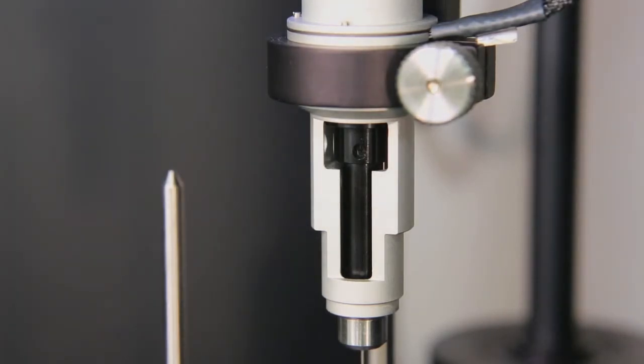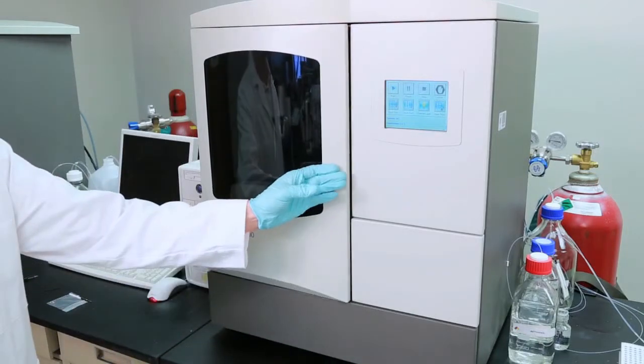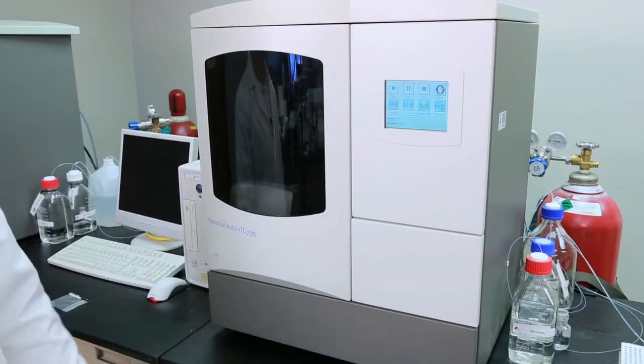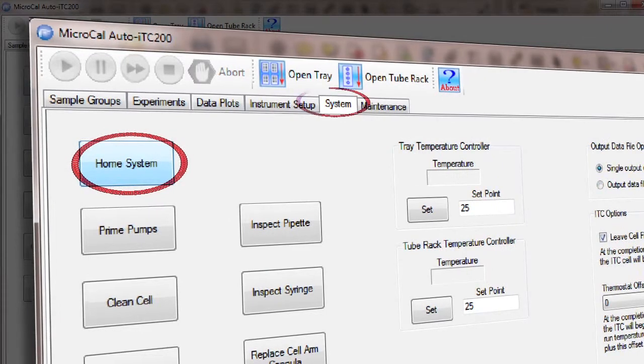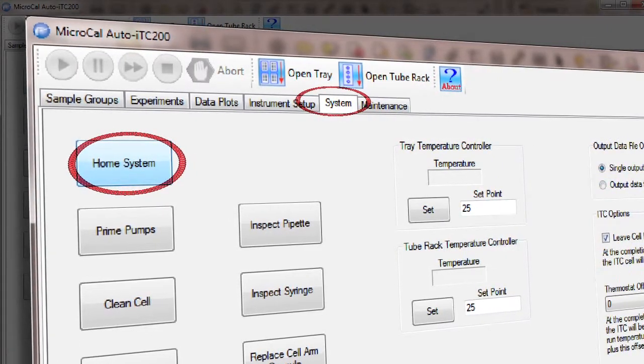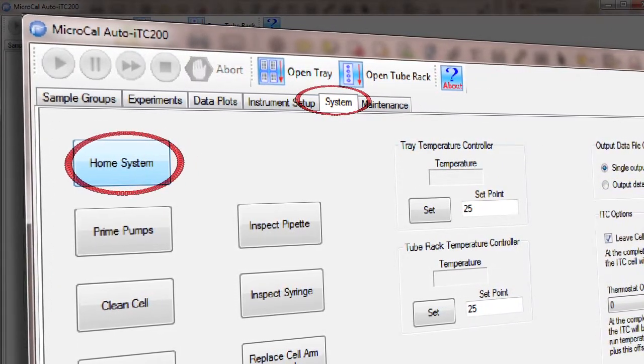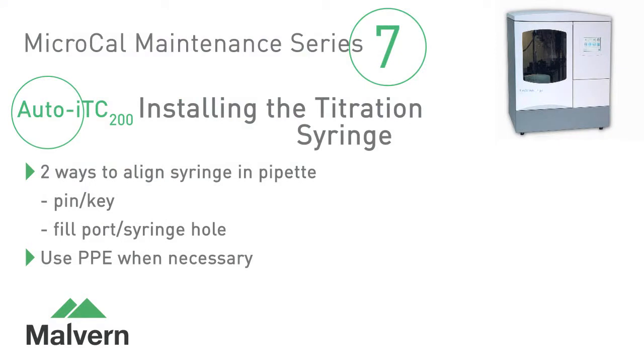As with any maintenance operation, the last step should be to close the door and home the instrument from the system tab of the AutoITC 200 software.